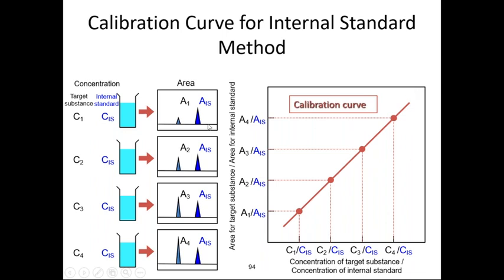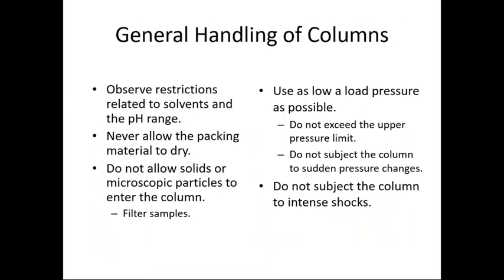So reverse phase HPLC, by measuring the area under the curve or the peak, can be used for quantitative analysis.